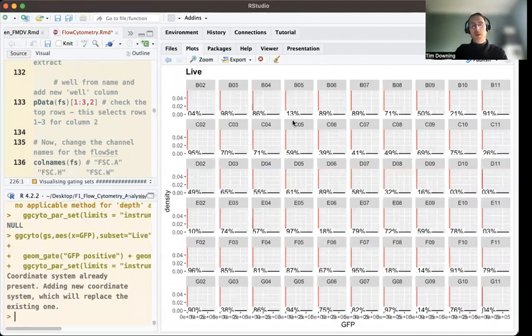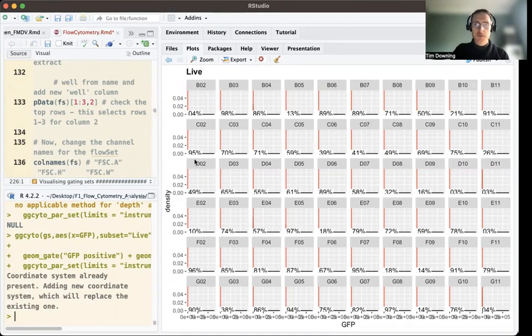Sometimes these plots take a minute to appear, and sometimes you have to rerun the command in case something didn't quite activate in time. You can see there for each plot we have the area detected for that particular subset. For some of them it's quite small, and for others it's larger. So this is much more variable across the different samples.